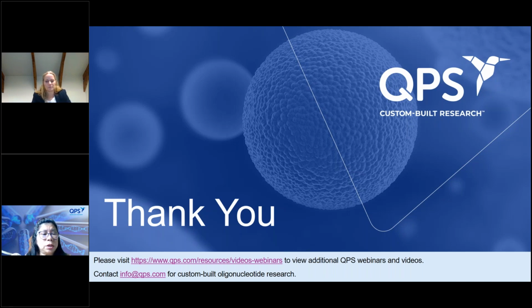And one last question, how long do you incubate with proteinase K? From the top of my head, I think it's around 45 minutes. Could be around an hour, but I need to check that. But yeah, so in that order.